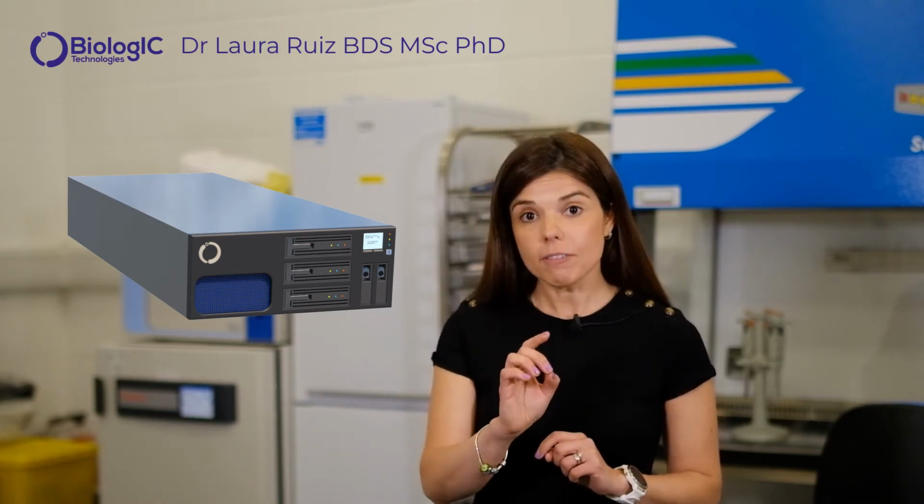The TDK is a configurable benchtop bioreactor system, so it can be designed specifically to fit your process. This is thanks to our 3D printing fabrication technology and configurable software. We can configure it for your full process or bottleneck areas that require optimization.